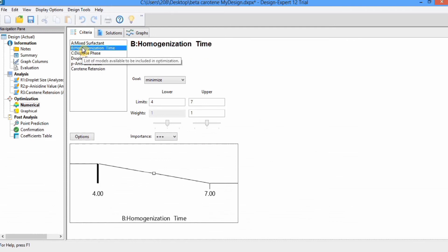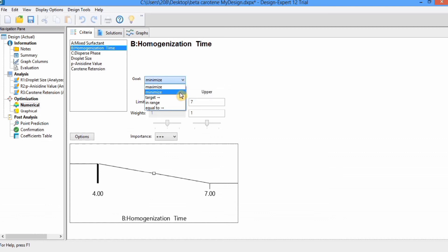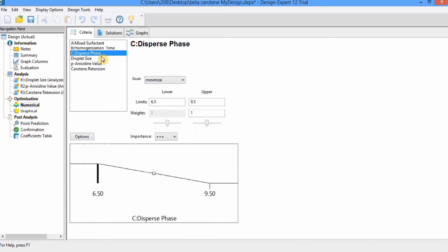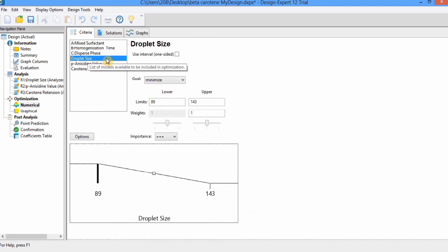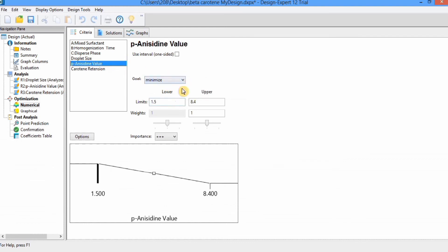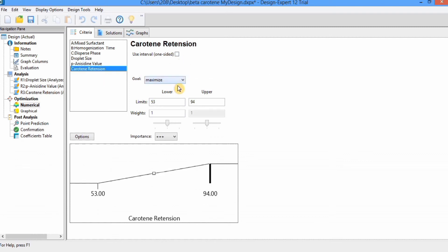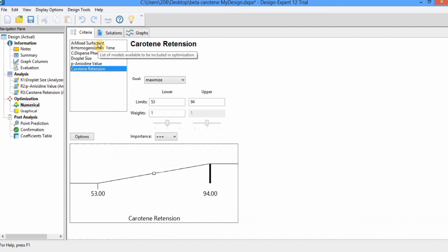For the next independent variable, homogenization time, I want the minimum, so I will select Minimize with an importance of three. Next is dispersed phase — I also want minimum. For the response, I want minimum size of nanoemulsion droplets, which is already set to Minimize. For PDI value I want minimum, and for vitamin retention I want maximum, so I select Maximize. Overall, my goal is to minimize mixed surfactant concentration, homogenization time, and dispersed phase, and to get minimum droplet size and PDI value with maximum vitamin retention. After selecting these goals, go to the Solution option.